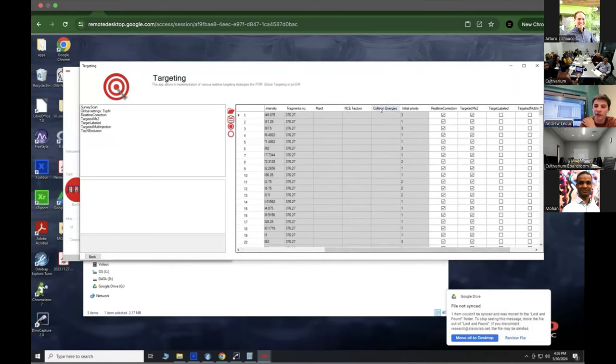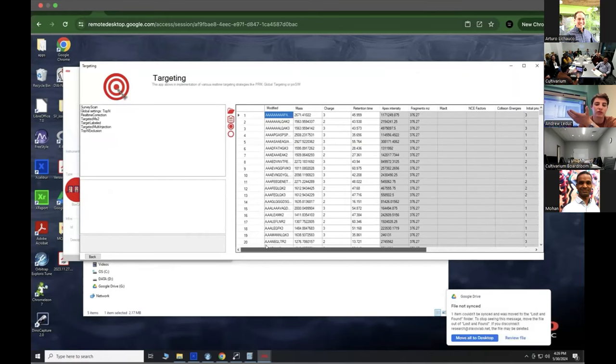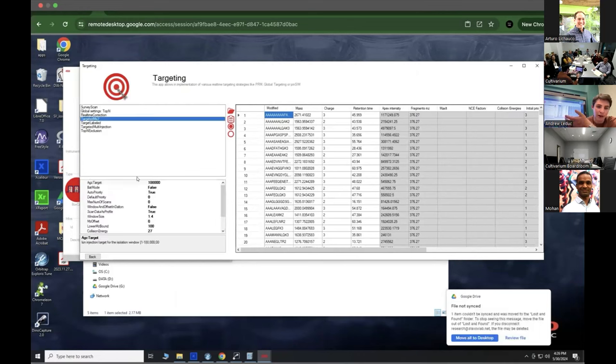There's other cool stuff that you can do if you're interested in playing around. You can change the collision energy that you want for that peptide. Say it's a really important peptide. You want to hit it with three different collision energies just to make sure you get what you want. You can change the fill times to be specific. You could accumulate longer for things you're more interested in that are more lowly abundant. There's additional settings over here about how the mass spec operates.